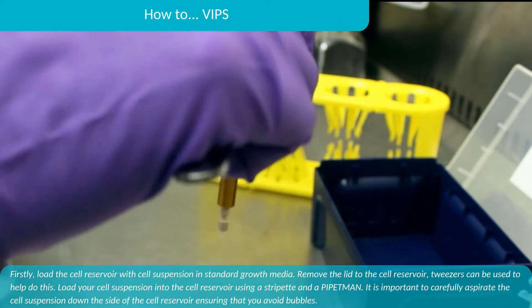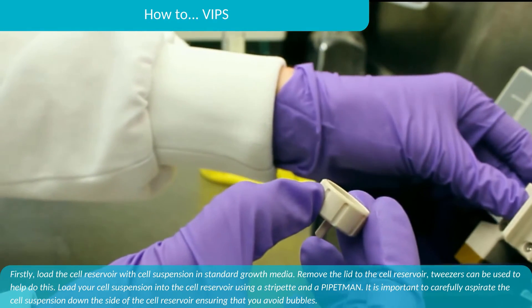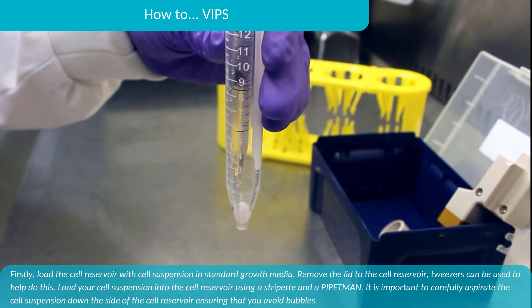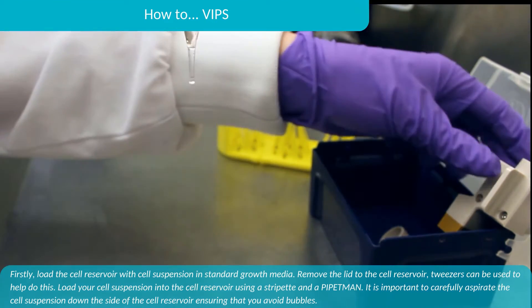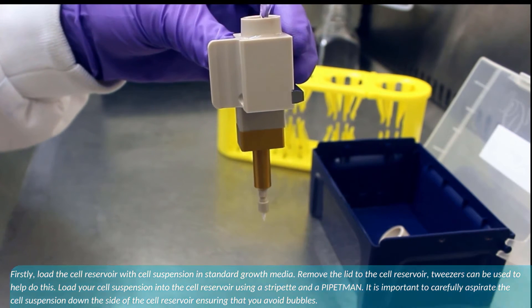Firstly, load the cell reservoir with the cell suspension in standard growth medium. Remove the lid to the cell reservoir — tweezers can be used to help do this. Load your cell suspension into the cell reservoir using a stripette and a pipette man. It is important to carefully aspirate the cell suspension down the side of the cell reservoir, ensuring that you avoid bubbles.